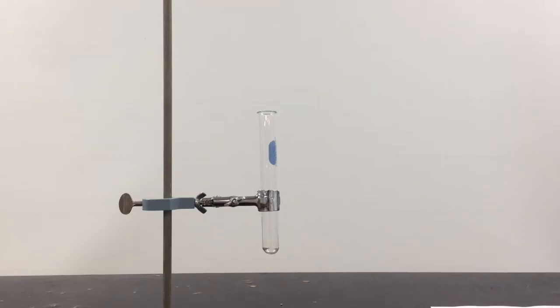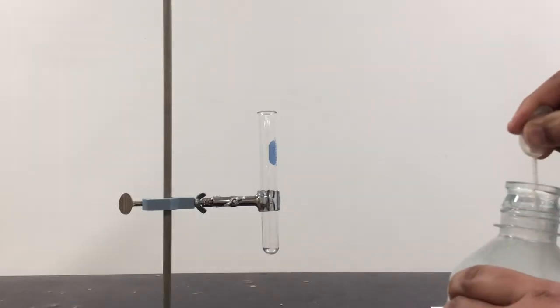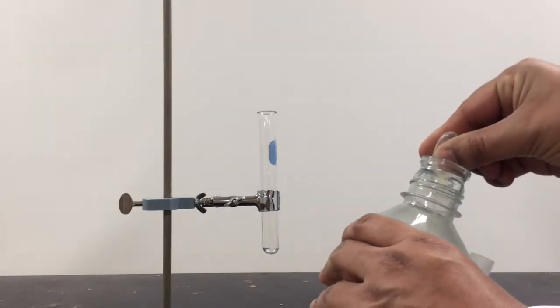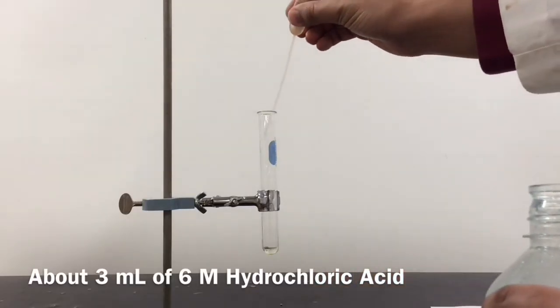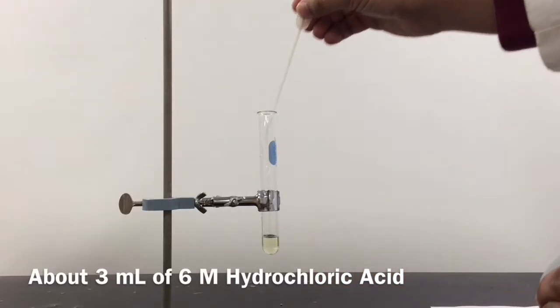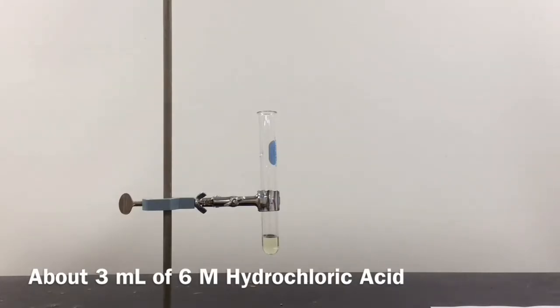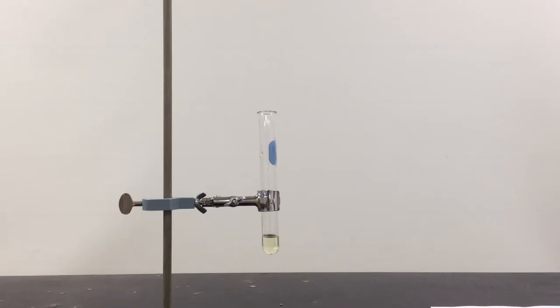This time I have a test tube set up here, and I'm going to add just a few milliliters of hydrochloric acid. This particular acid has a concentration of 6 moles per liter, so it's pretty concentrated.